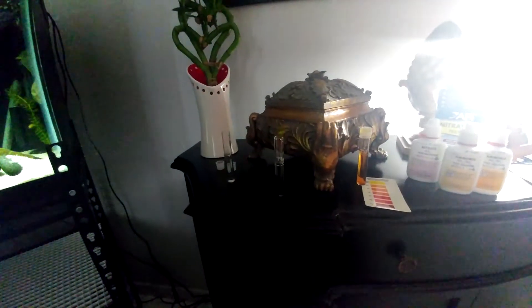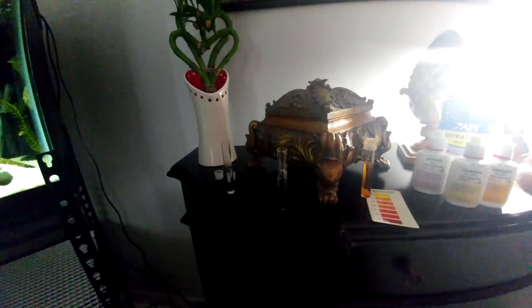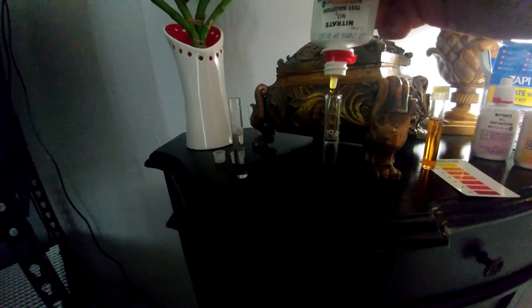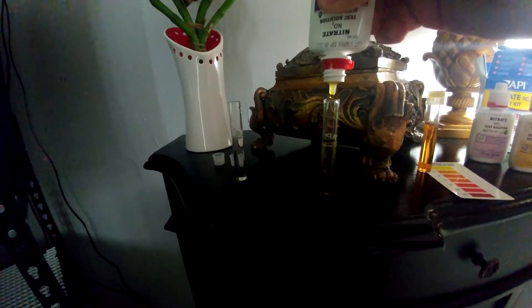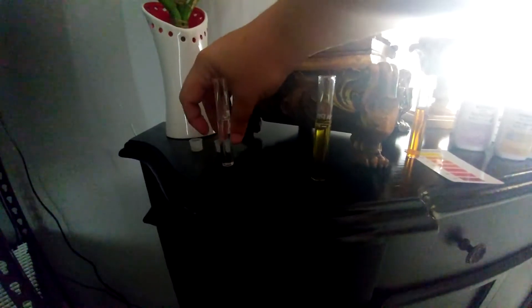Make sure that the tube is level to the line with your tank water. Then you have two bottles — bottle number one, nitrate. You don't really have to shake it much, just move it around a little bit. We're going to pour 10 drops in. All right, we got our 10 drops in.